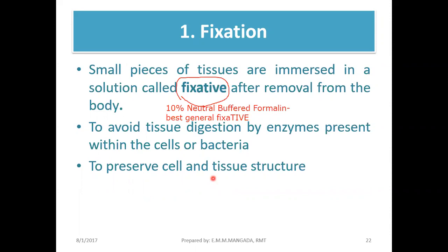So isipin mo, how will you examine now a tissue, or for example in histopath, how will the pathologist do proper diagnosis if naagnas naman na pala yung tissue na ginagamit mo? So, marami nang nangyari dun sa tissue that's not actually related dun sa possible disease na gustong i-diagnose ng ating patho.